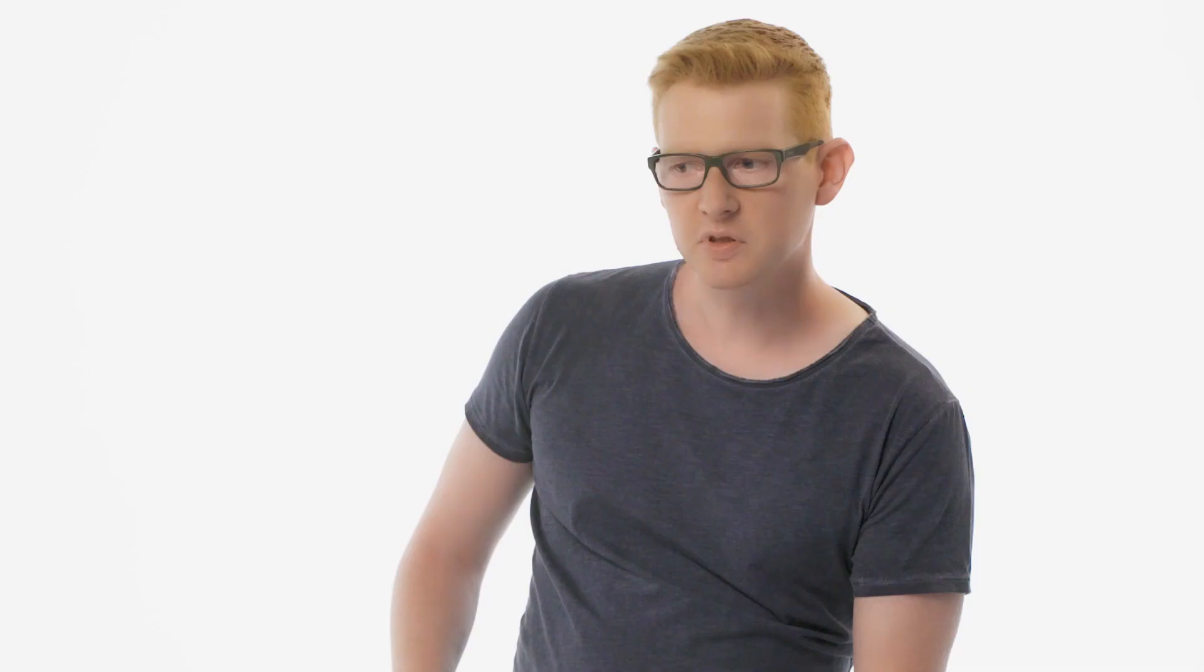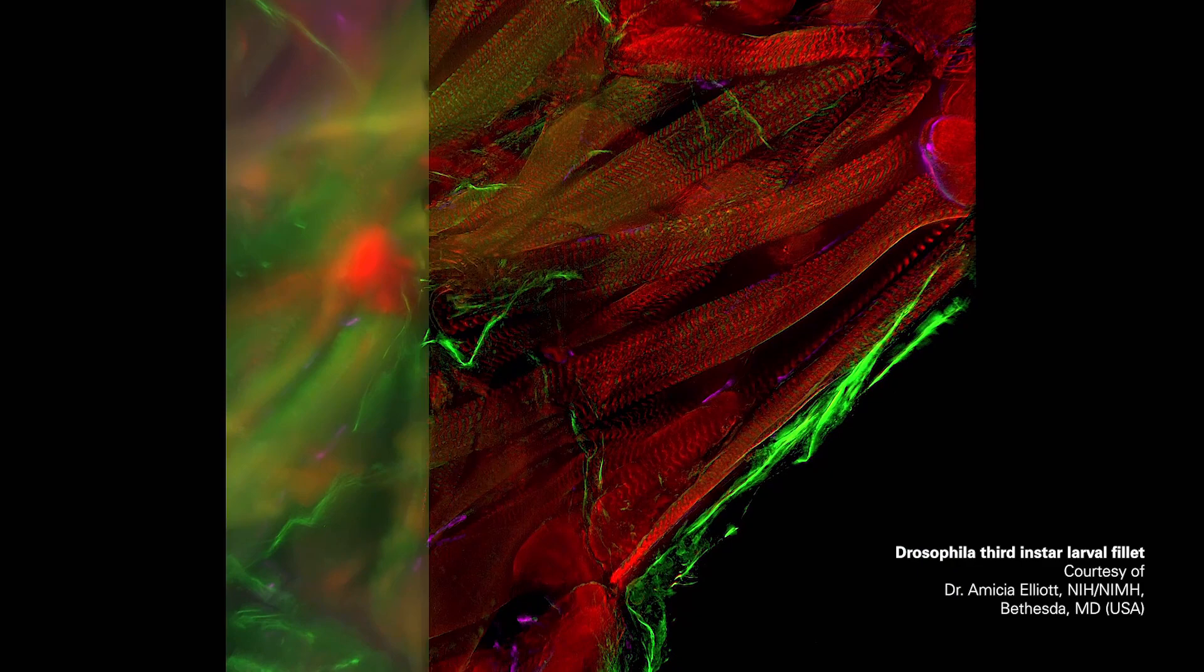And the best thing is that it works already on a single plane. With the Thunder imager what you get is on-the-fly removal of out-of-focus blur, so superb axial resolution and ultrafine morphology is just one click away.